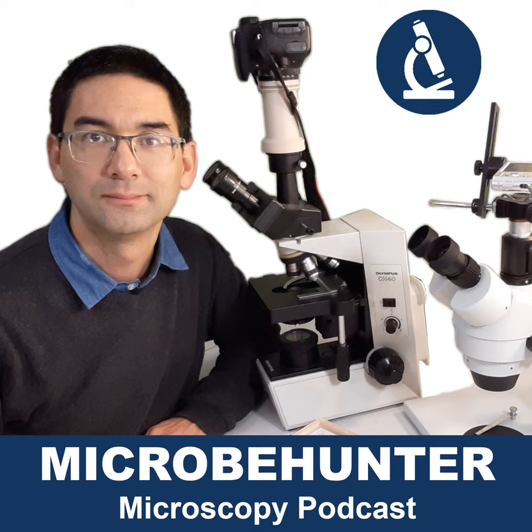For example, I've exchanged one of my objectives, the 100x oil immersion objective, with a very low cost, no name 60x objective, and of course it fits into the microscope, but when I change the magnification, I have to refocus a little bit. It's because the objectives are not parfocal. Parfocality refers to the fact that you do not have to refocus the microscope when you change objectives. Okay, so that's fine.